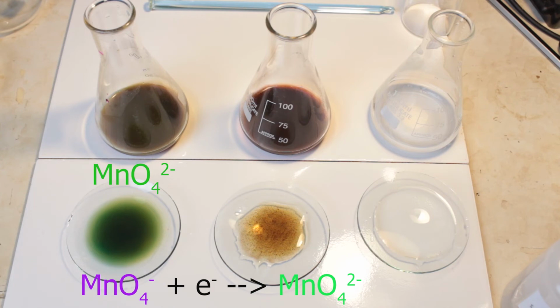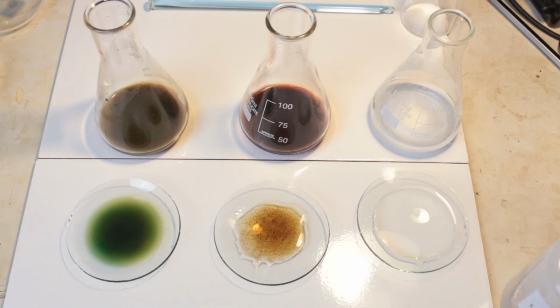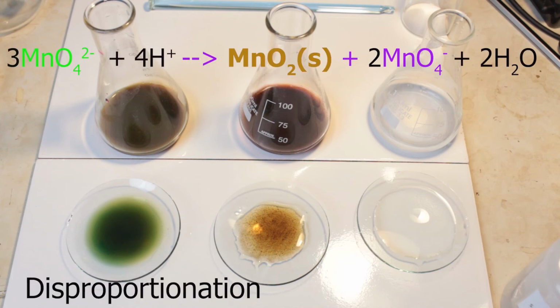And oxidation state is changing from +7 to +6 only. At the same time, if you are attentive enough, you see that the color is changing already. It's not as intense green. It's actually disproportionating. If you wait a few more minutes, disproportionation is really visible. Disproportionation reaction, oxidation and reduction at the same time, is written on the top.